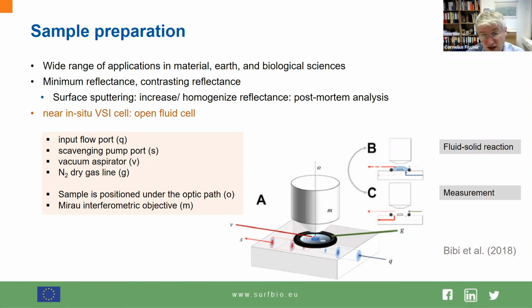And the second thing that we have to maintain is that over the entire sample surface, the contrast in reflectance shouldn't be too high. Why? During the measurement, we cannot modify the light intensity. This means if there are a few portions with low reflectivity, they would probably provide an intensity pattern that might fall below the signal-to-noise ratio of your camera.